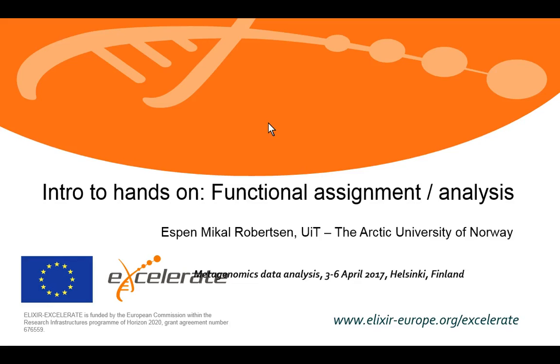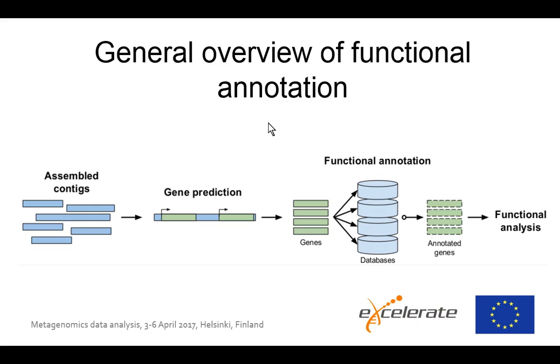Okay, so the next part of the assignments will be the last part of MetaPipe, which is basically the functional annotation. So, a quick overview, the general overview of functional annotation. If you're doing assembly on metagenomic samples, this is basically the generic workflow for everything.